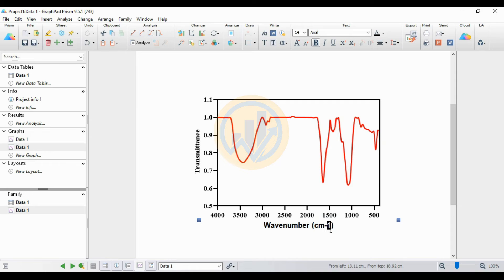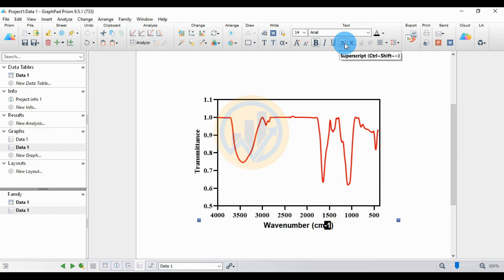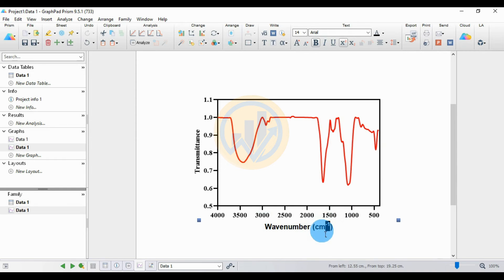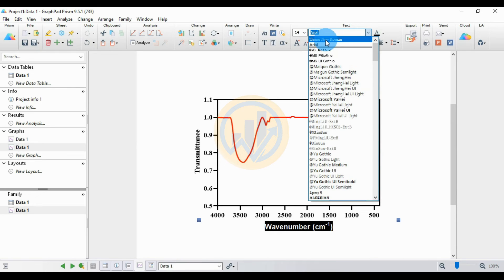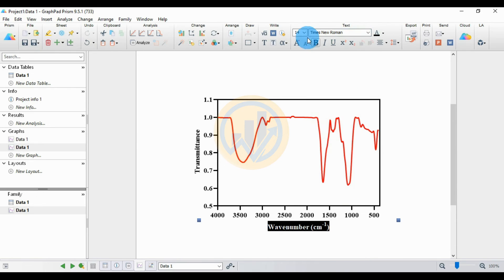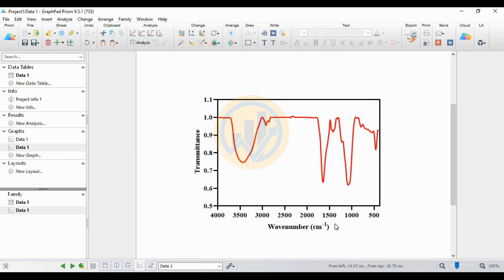Choose 'Format Text'. Select the minus one value and go to superscript using the x-squared click option, changing it to superscript. Then go to the font menu and set the size to 14. Apply this formatting to the wave number label, both vertical and horizontal.